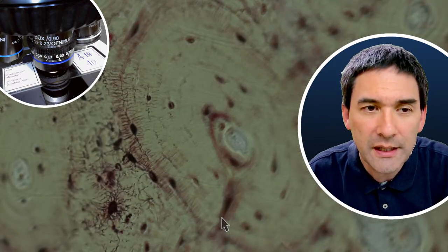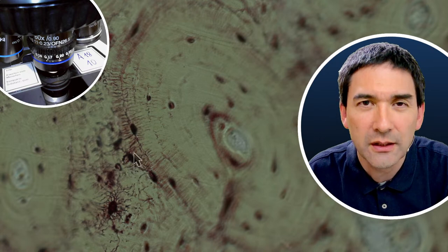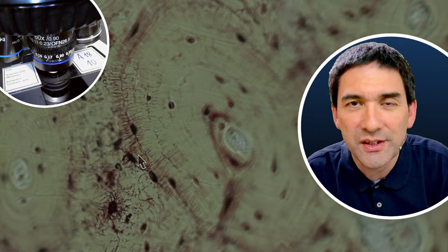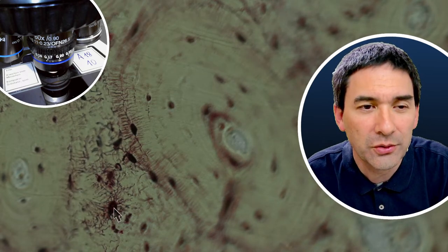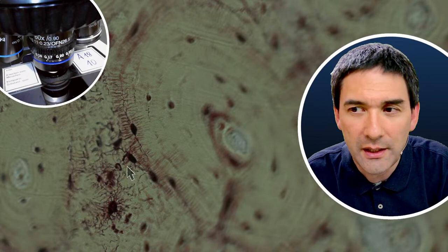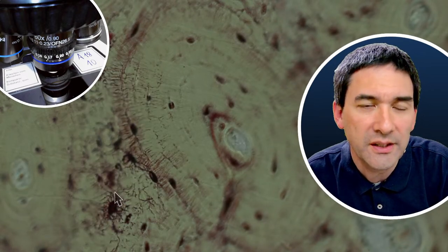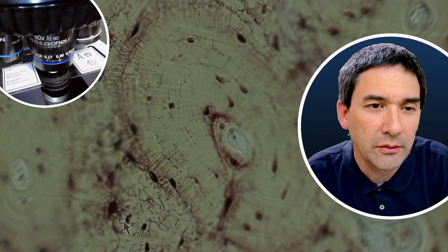But what's very nice to see here are the little transversal canals, little extensions. These cells remind me a little of a nerve cell, which also has dendrites and axons, but of course these are not nerve cells. It also illustrates the density of the cells here, which is not so high. Still, overall, there are quite a lot of cells in bone. So bone is, as I said already, a living material.